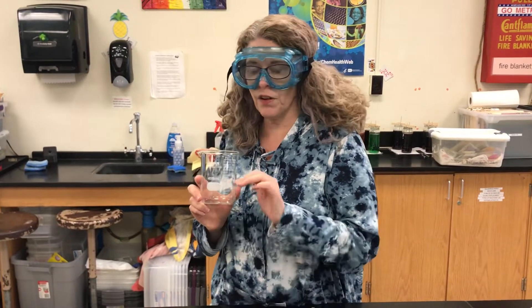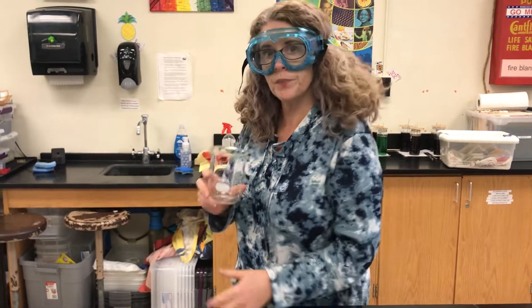So I have a 400 milliliter beaker which I'm going to fill half full with tap water.